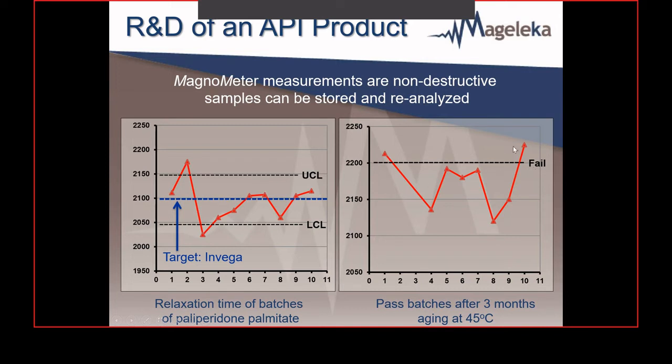And what we find is two of those samples have gone outside of this. According to this line, those two samples will also not be acceptable. Of course, if you're going to do it in reality, this would need a lot more study and method development before actual implementation. But what it shows is the proof of concept that you can use NMR relaxation to do these studies for you.